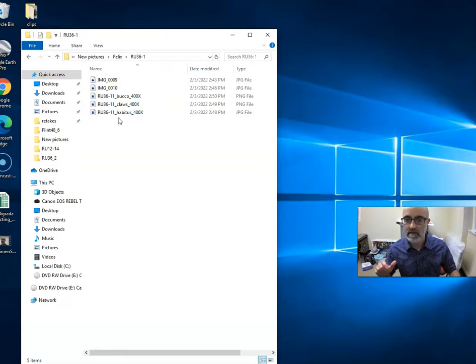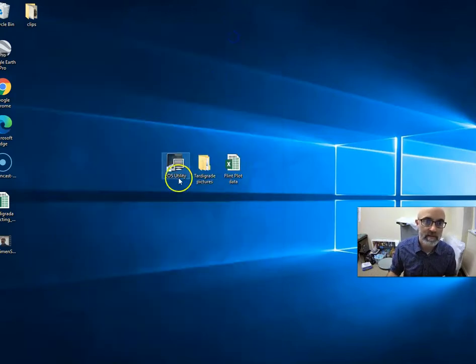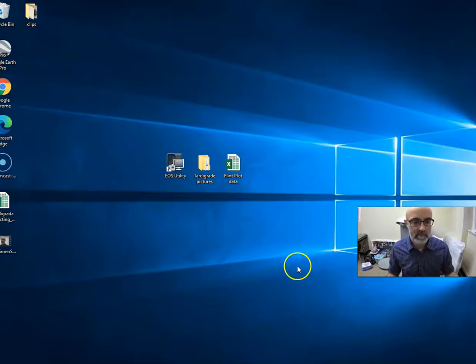You will log that. You'll take this slide that you just were photographing, and you'll put it in the have been photographed box. You'll go back, get another one from the to-be-photographed box, log it, put it on the scope, turn on the scope, turn on the camera, go to the computer, turn on the EOS Utility, and take your pictures and save them. Submit all that to Canvas, bam, very good grade.